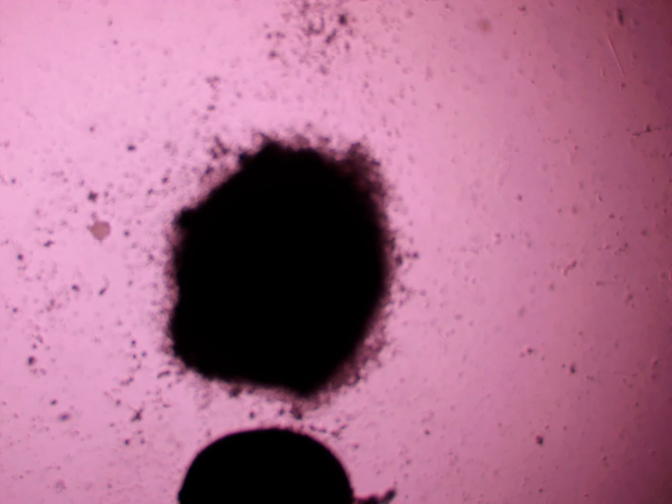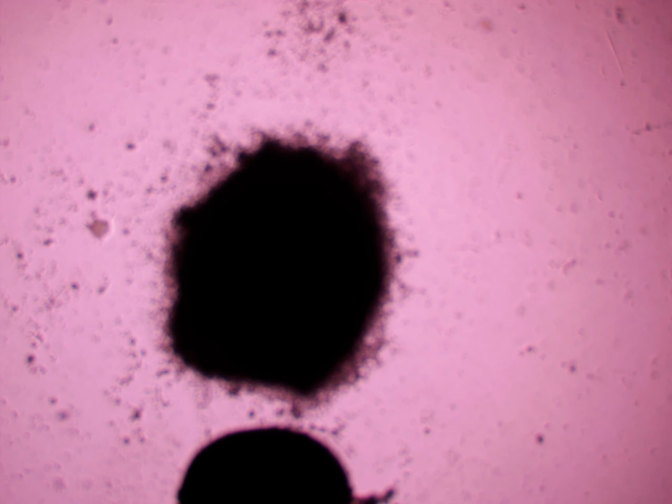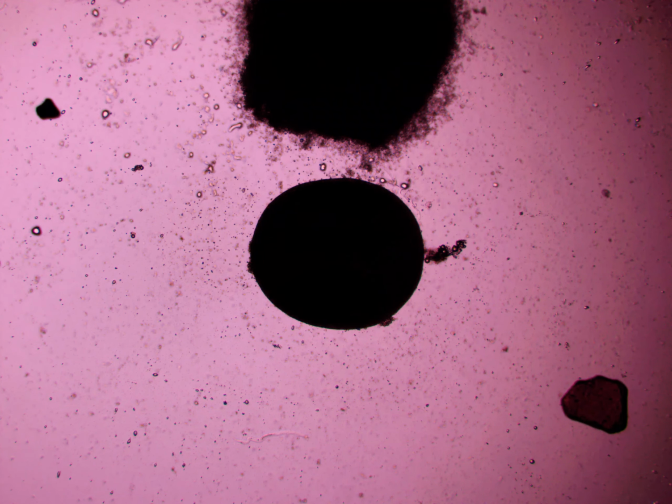And I adjusted the color temperature a little bit, and we're ready to take a closer look at this bacteria once I switch the objective, which I'm probably not going to do for a while. I probably should have cut this part out, but you can see it pretty well now. And now I have everything adjusted.